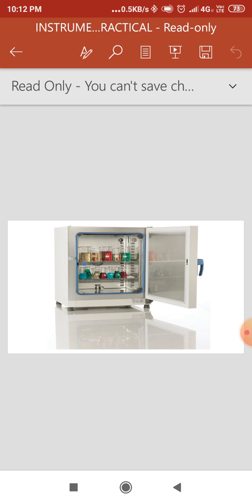The incubator is a box container with insulated walls, and a door fitted with a latch to close the door firmly. A hole in the center of its roof is there for insertion of the thermometer to read the temperature inside the chamber. The thermometer is provided at the top.